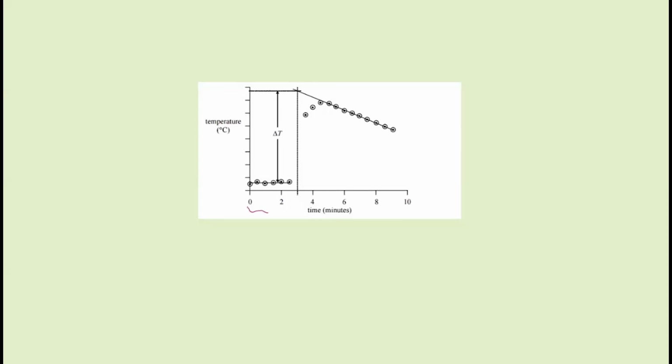So here you've got that initial temperature for the first 2.5 minutes. So you can see that this is our final reading at 2.5 minutes, and you'd expect it to stay roughly the same because you're allowing your initial solution to attain the temperature of room temperature. And then on your third minute here, you add in your zinc, and remember that's in excess, and you see the temperature from the 4th minute here. I feel like they've recorded that a little bit earlier than 4 minutes, but you can see that it's increasing nonetheless.